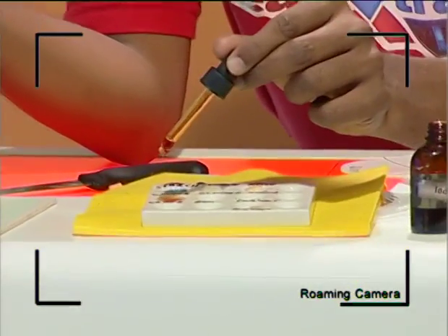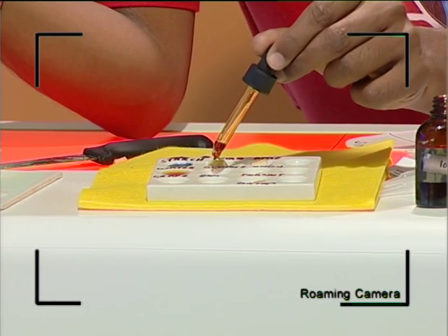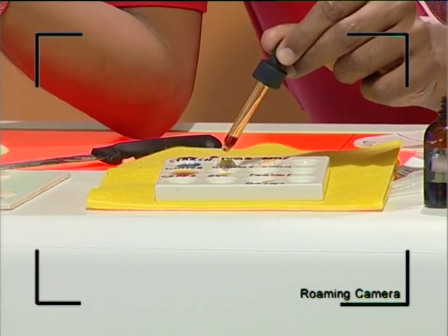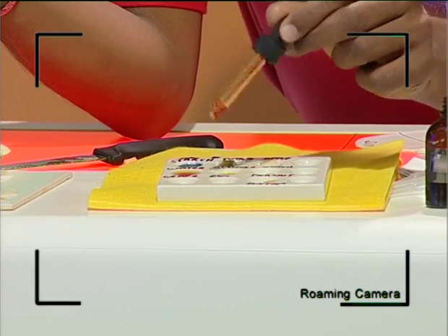So let's look at it in grape. In grape, no color change. Let's go to the piece of potato. We obviously tested that, so that's a positive color. The standard glucose solution again remains yellowish brown, so obviously the absence of starch. Let's look at eggs. And what would you think? No starch in eggs, and we know that, guys.